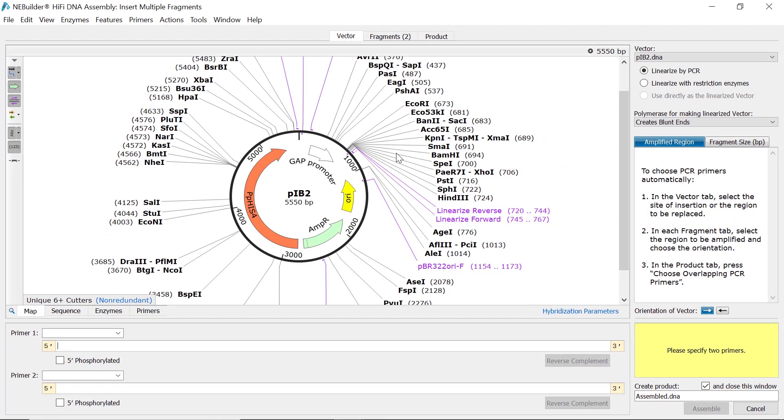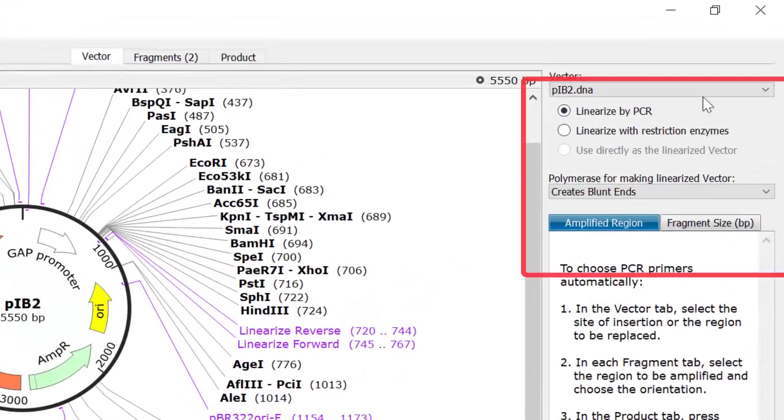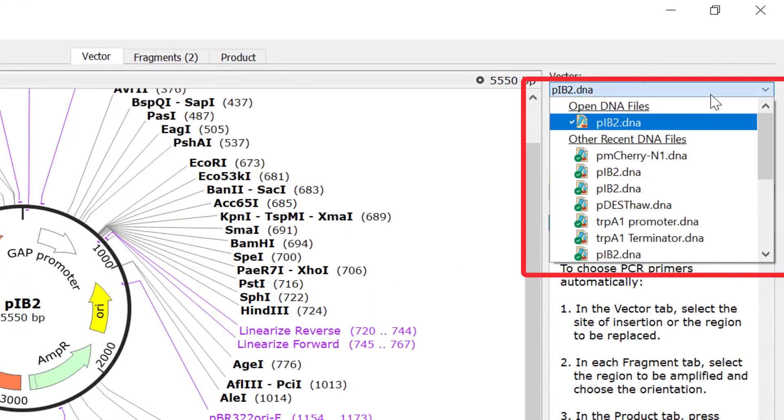In the new window you can define and prepare your vector for assembly. If a file was already loaded prior to opening the NEBuilder HiFi assembly window, this will be automatically selected as the vector file. To change the vector file, you can use the drop-down menu in the top right.